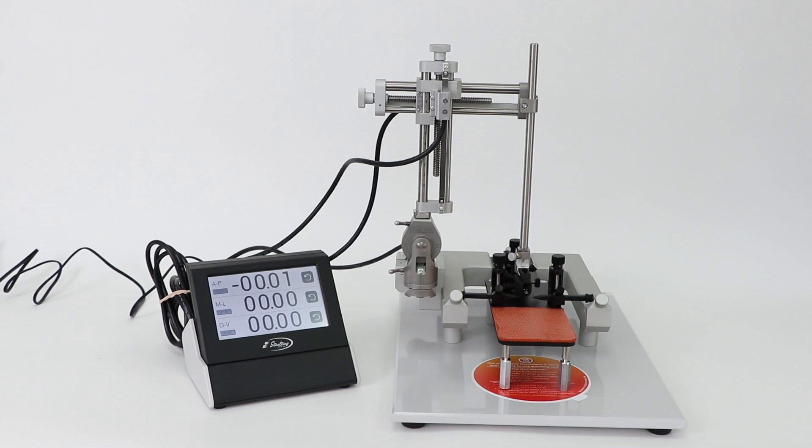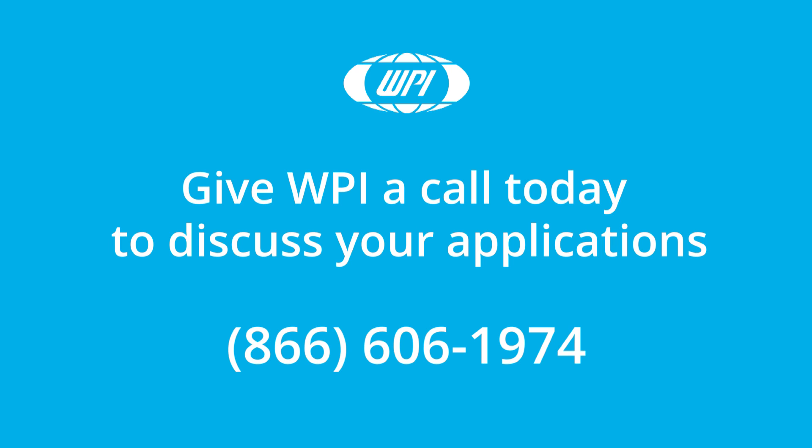Your digital rat mouse and neonatal rat frame is now ready for use. If you have any questions, just give us a call.